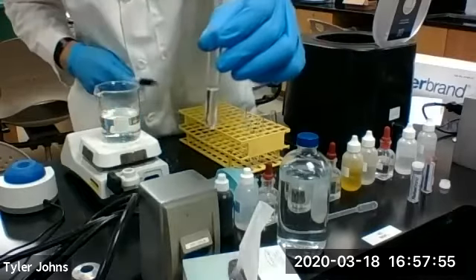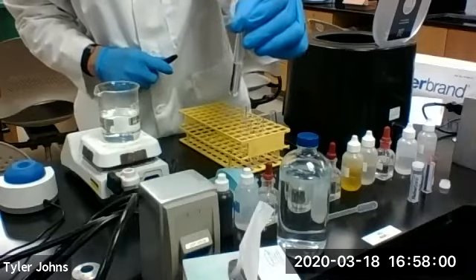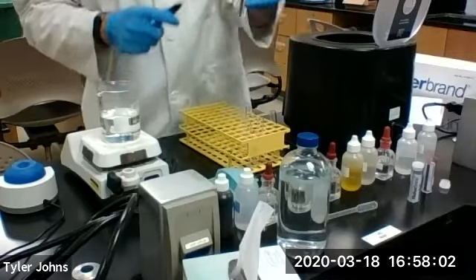This solution will be labeled S14, and it will be saved to analyze for magnesium ions later.